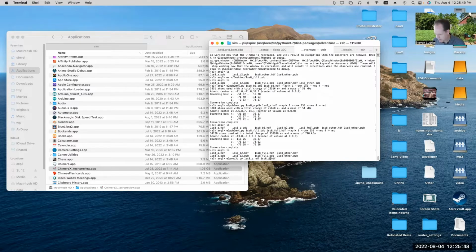We'll go ahead and give it another name. I'll add a center to it just so we have a complete history of what we've done. If you overwrite the output files, it'll work fine, but then of course you'd have to go back and rerun programs if you wanted to recreate things. e2proc3d, 1SS8 to A, send, trans, -43.8, 0, 0.